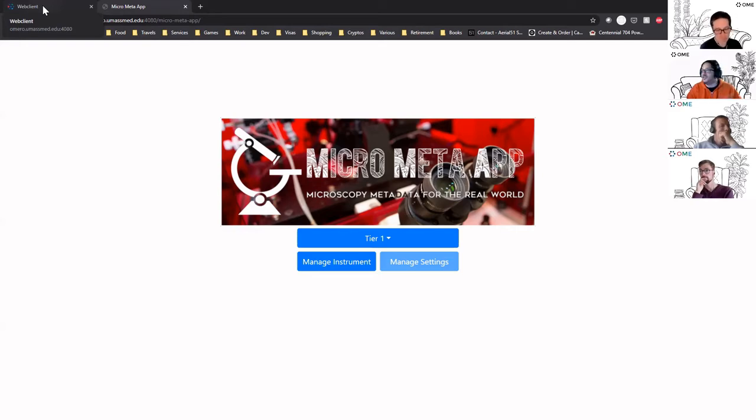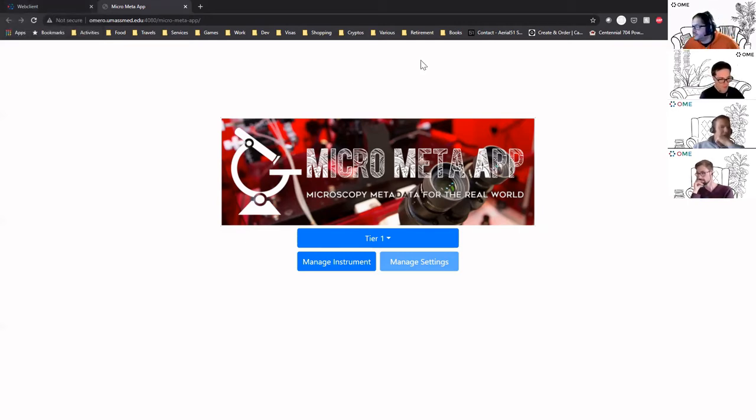And it's usable from any other web services, so it should be easy to import and handle the data in whichever way you prefer. Integrating with bits of other metadata schemas should work well. Brilliant, thank you.